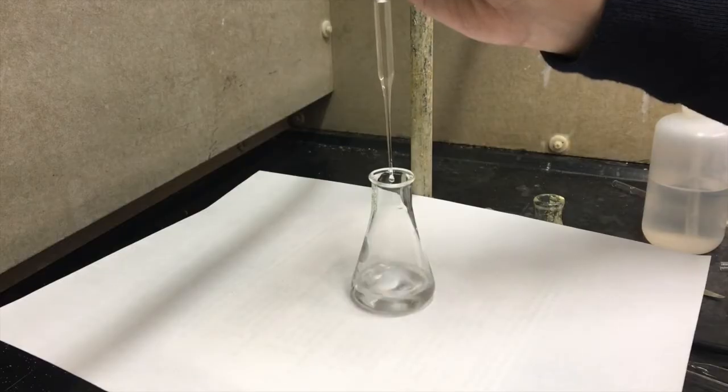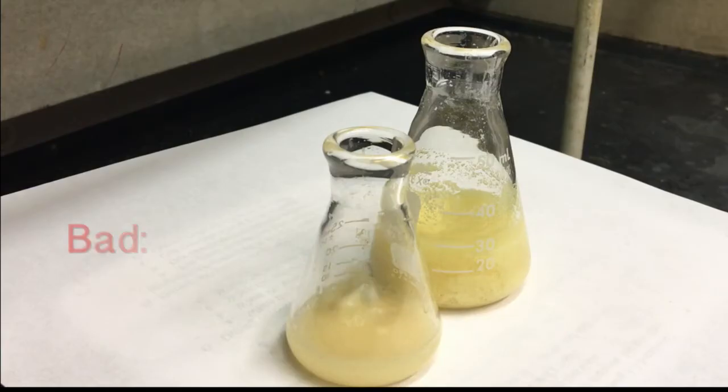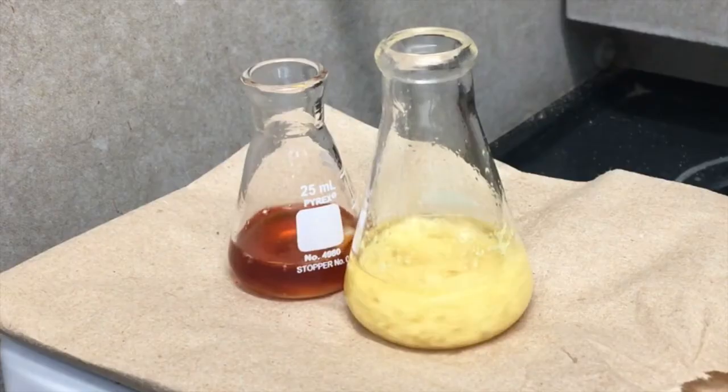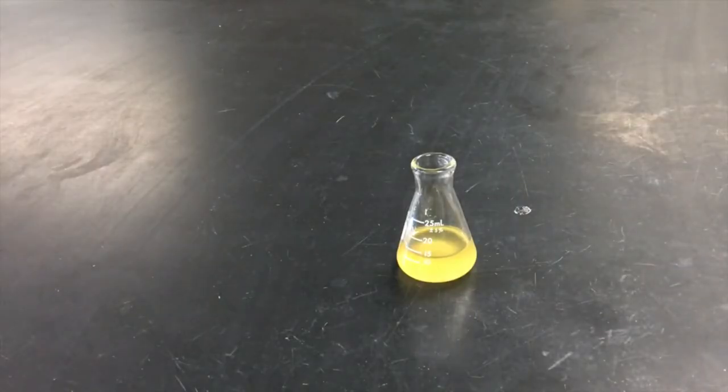Vortex again, once again combine the two dropwise while it's spinning as fast as it can. If it ends up looking a lot like product A, then you messed up and you need to start again. But if it's clear, and dark orange, or a little yellow, then that's fine.